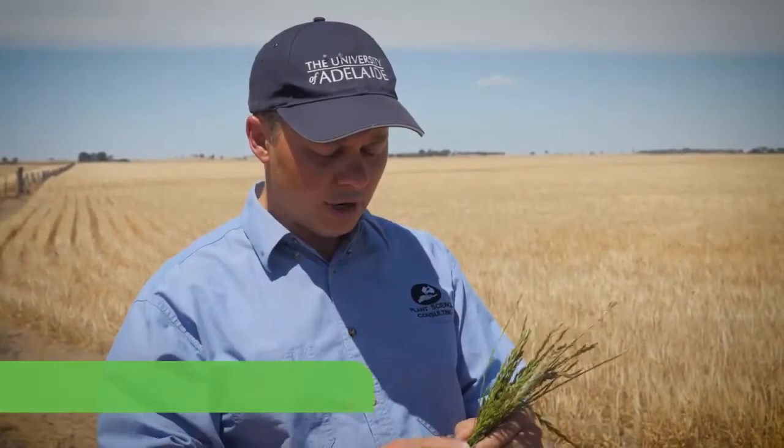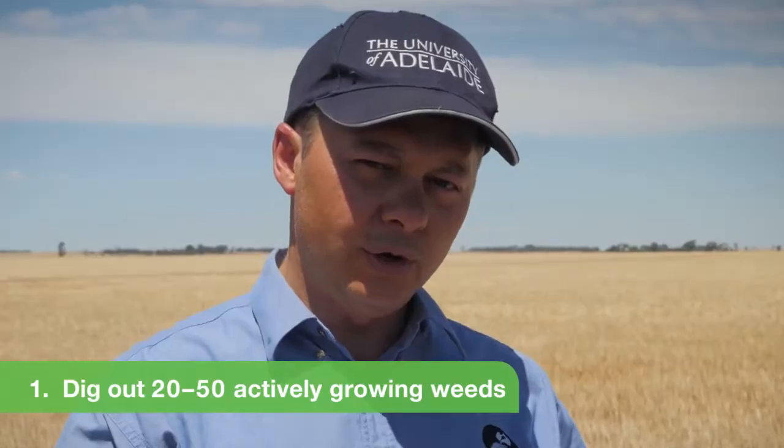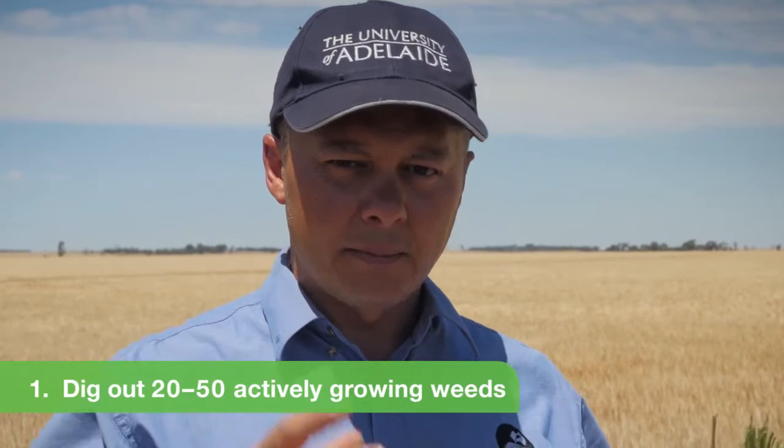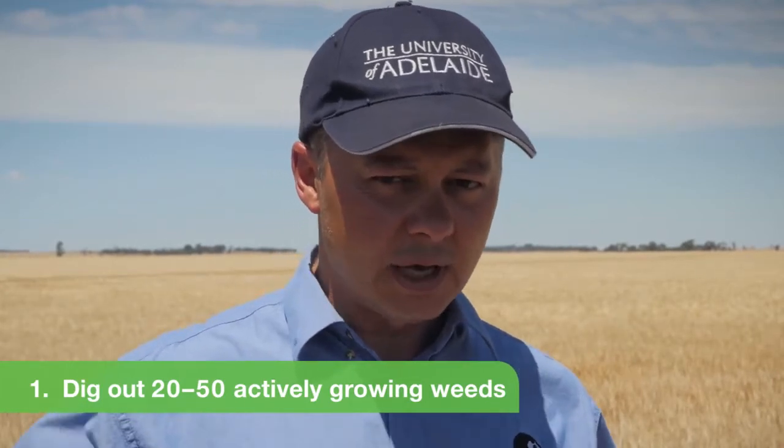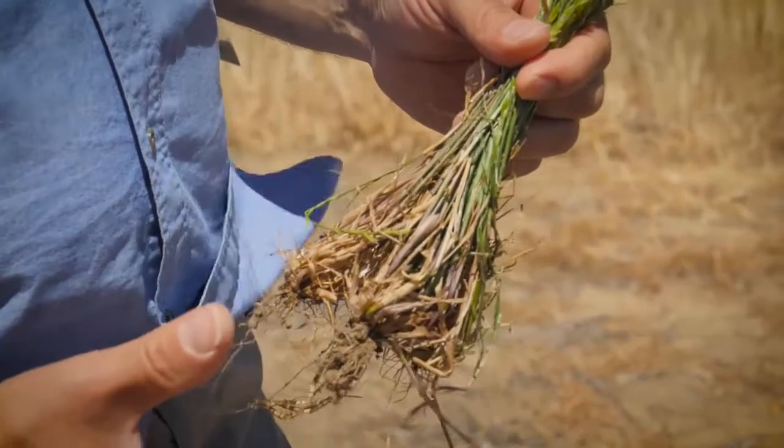So how do you do the quick test? Well, from your side, all we need is to pull out about 20 to 50 plants. What we do is we can split the tillers, plant the tillers into different pots and spray them with different herbicides. This sample is suitable for a quick test.